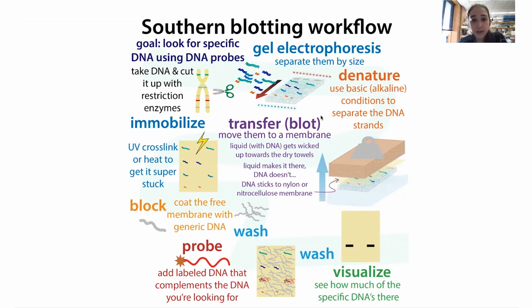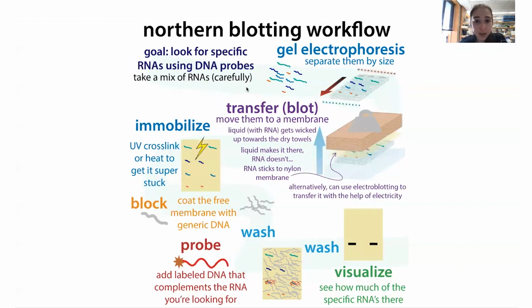But in these cases, you're denaturing so that you can have the probes bind and not have to worry about that stuff, as well as have them travel the size that you would expect them to be when you're talking about a northern blot.